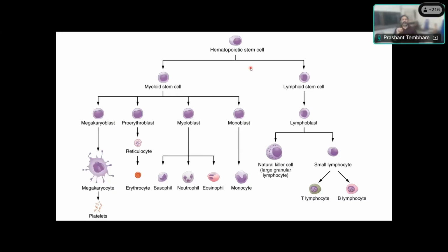For example, if we want to study T lymphocytes, we identify them using CD3 expression. So we take CD3 positive cells, and because we do not want to see other cells and just want to focus on T cells, we use an electronic or digital window that allows you to study just the specific population.